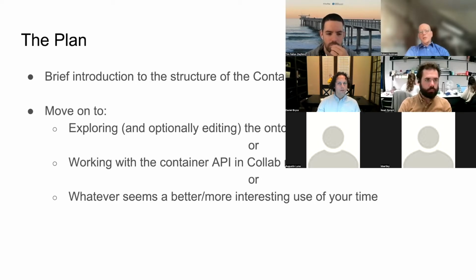Then I thought we could move on to one of the Colab spreadsheets where I show how you can interact with the server, and then after that we could move on to actually working very much inside the ontology, either poking around inside it and working on expanding it, or working with enhancing the container API, if that's interesting.